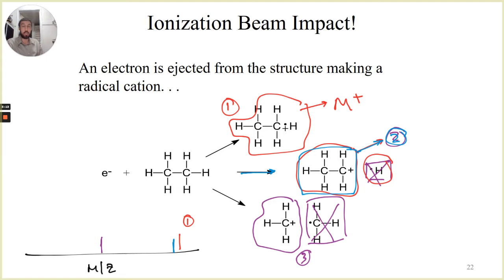Well, what's the height of those individual signals? In this case, I haven't addressed the height. That height has to do with the stability of each of those pieces. The more stable the piece is, the more likely that that action happened, and we would therefore see a larger signal come out of it. So that stability now has to get addressed with looking at what makes each of these reactive. That thing that makes it reactive is that positive charge.